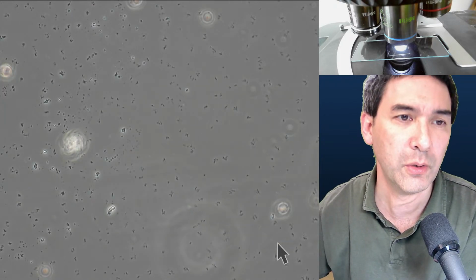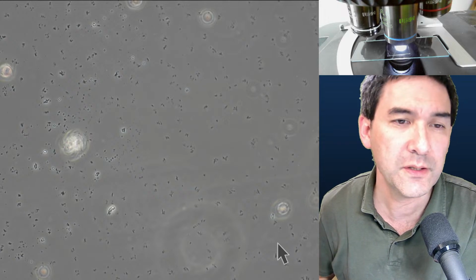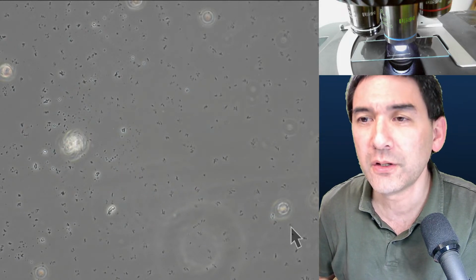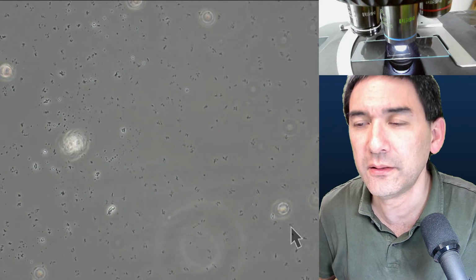Bacteria are small and difficult to see. You see over here, some of them are even in tiny chains. So I'm going to quickly read again.